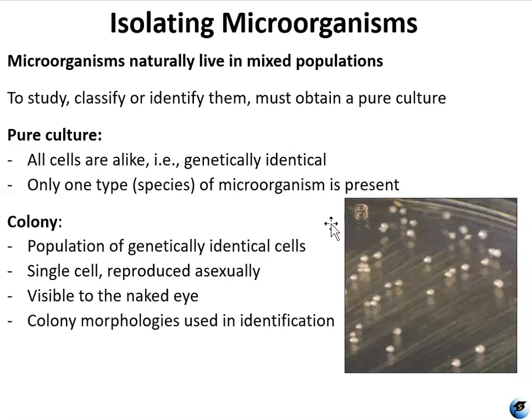And in order to get a pure culture that has only one species in it, you're going to have to first isolate that specimen. So what you're doing is you're taking a mixed culture or even a pure culture. You can always isolate another pure culture. But the point is that you are going to use a very specific technique in order to obtain isolated colonies.